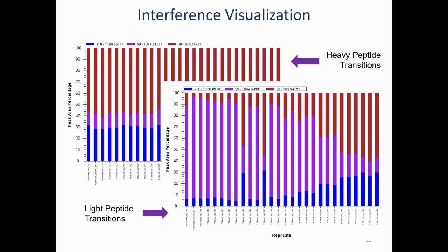match exactly, pretty much. And so you can see over here, these 3 or so samples matched really well with the heavy. What you don't know that I'm going to tell you is this is a calibration curve going from the blank with no light spiked in to increasing light as we go up and up and up. When we get to this point, that's when these ratios match with the heavy. But over here, there's this whole humongous interference from the purple transition.